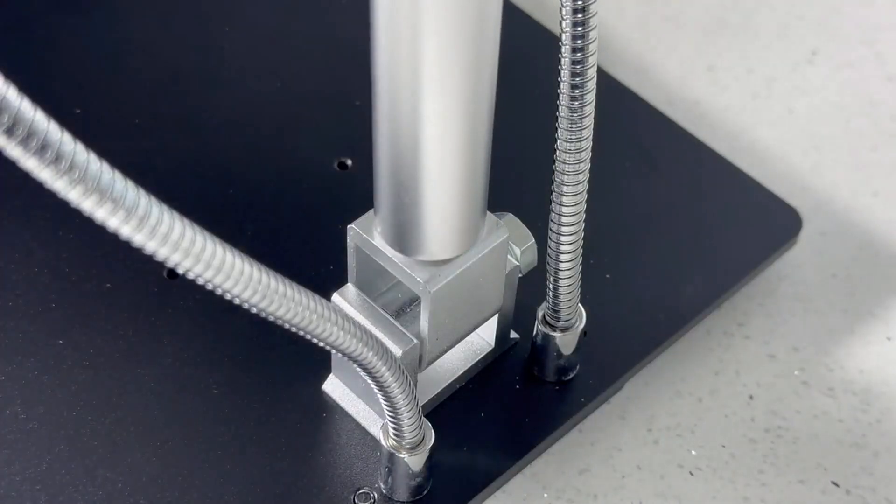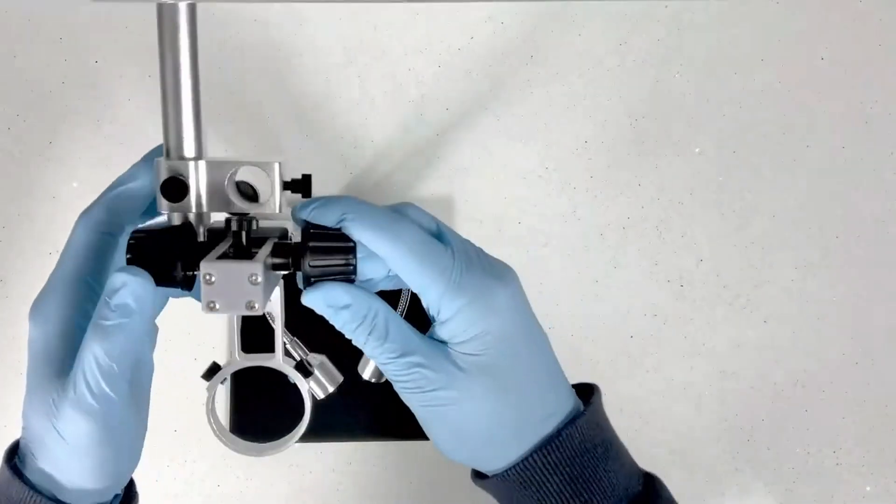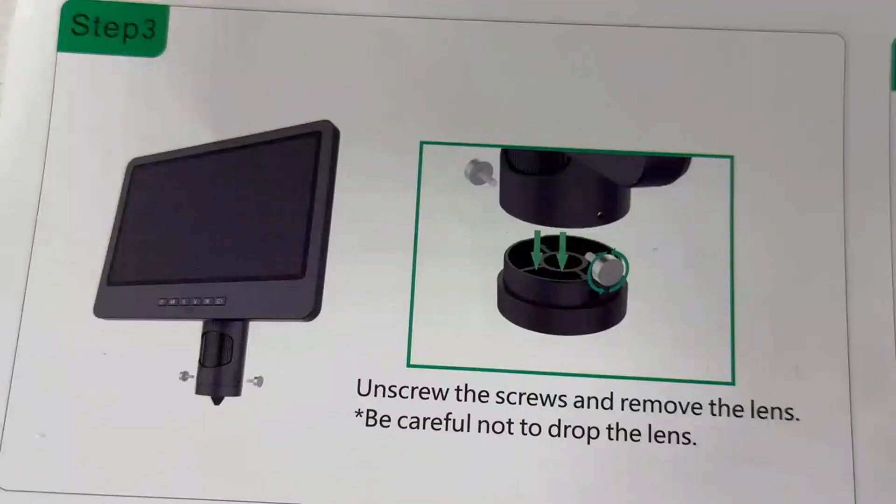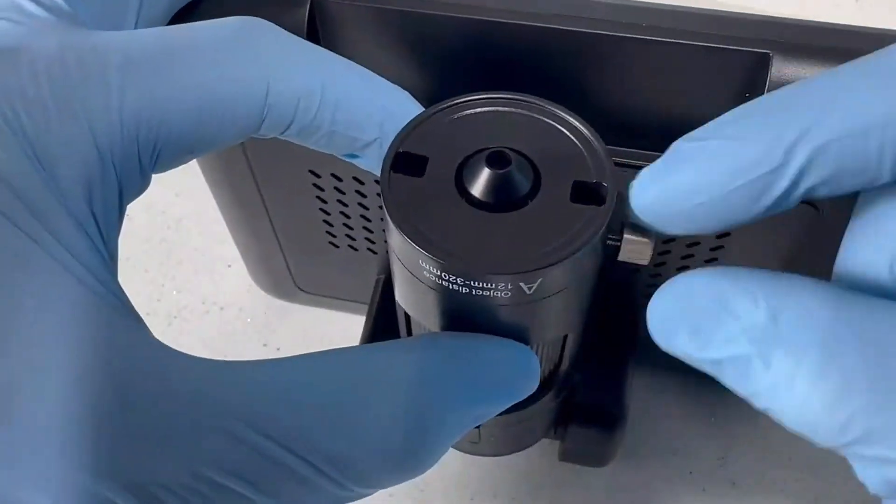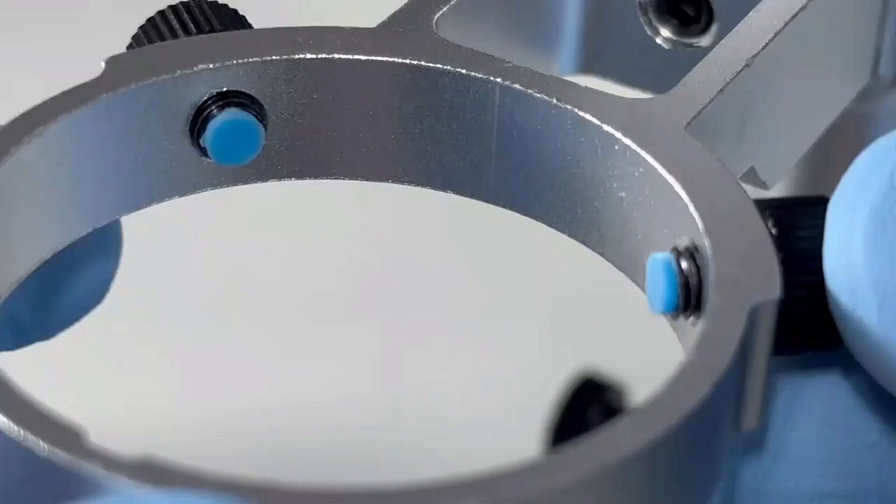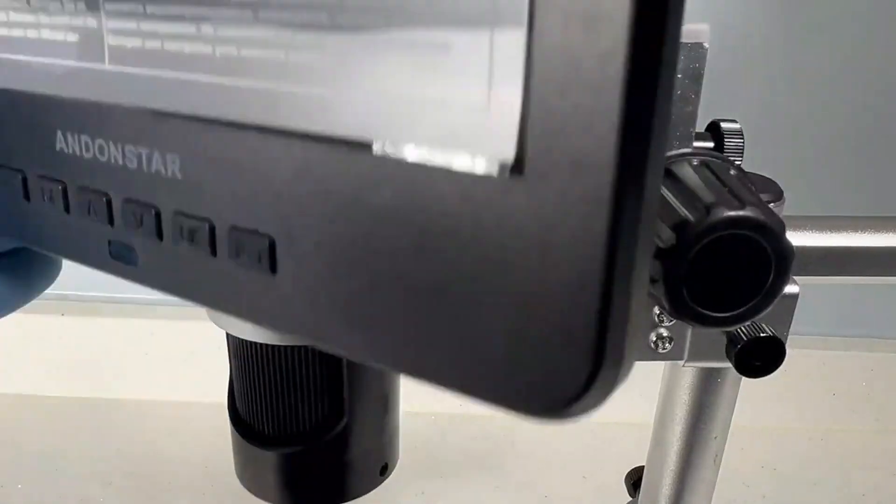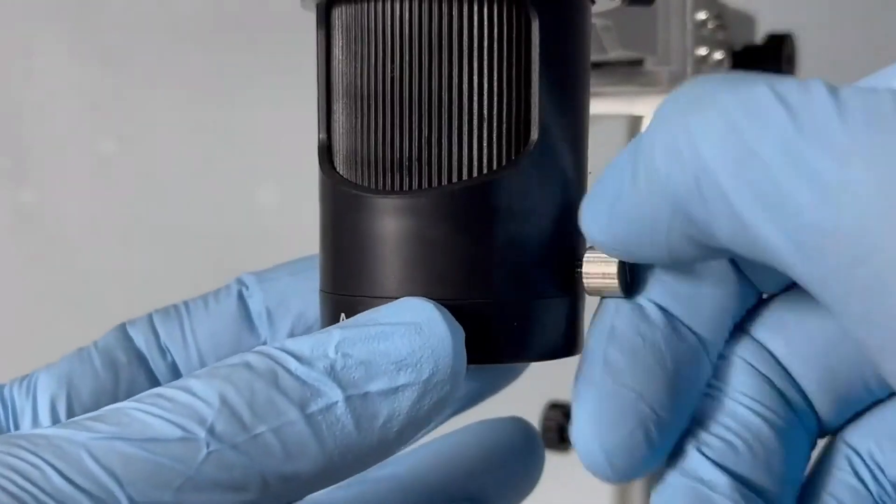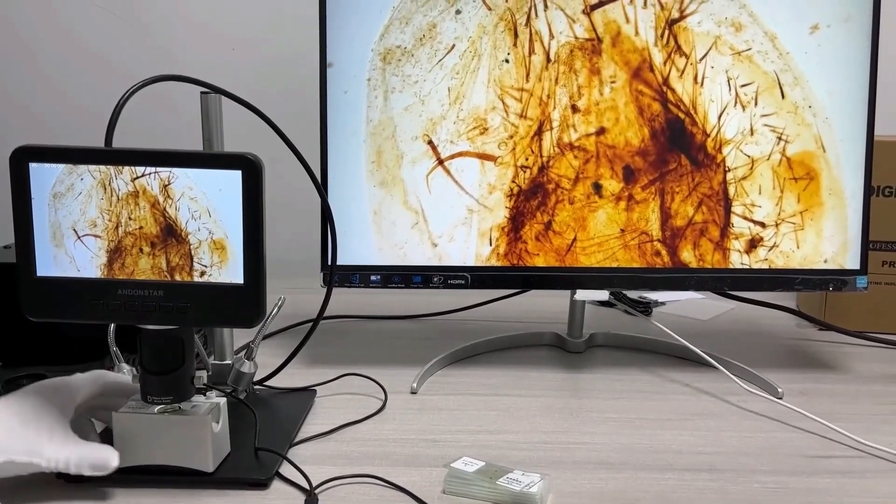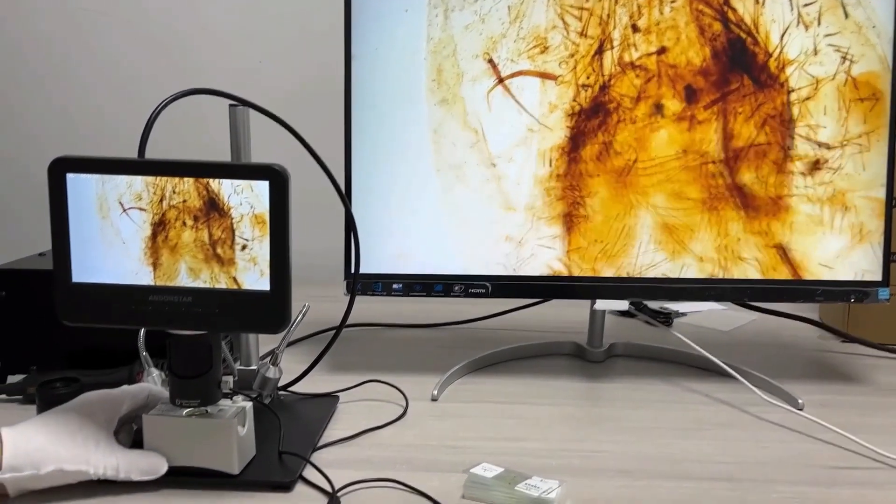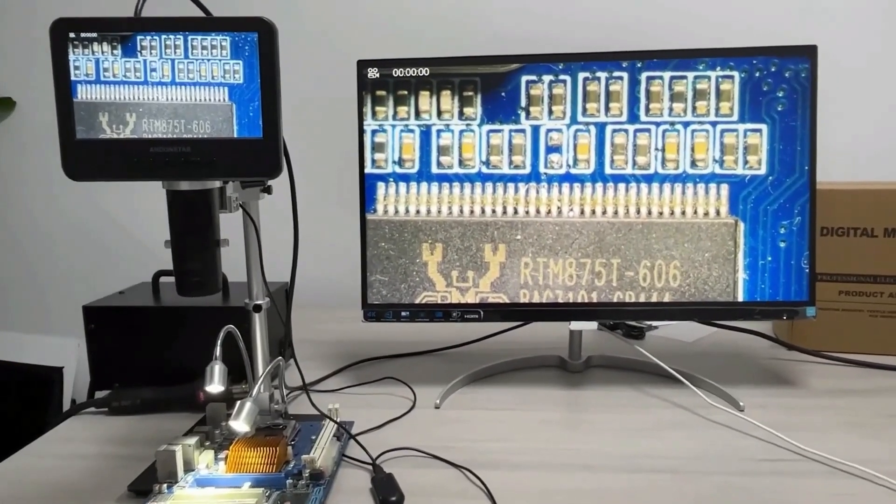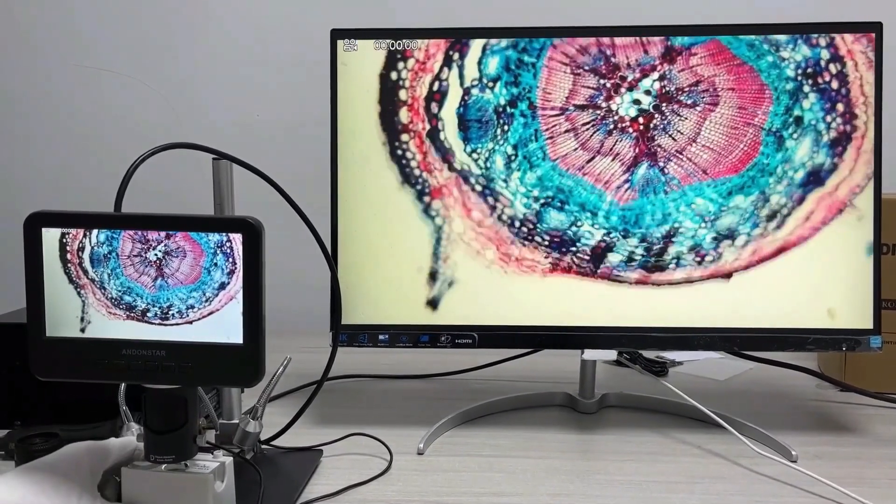Capture your findings effortlessly. With the included micro SD card, you can take and store photos or videos of the fascinating micro world you observe. This microscope isn't just for serious projects, it's also a fun tool for exploration. With the Andenstar 3 lens digital microscope, you're all set for an exciting journey into the world of the tiny and detailed.